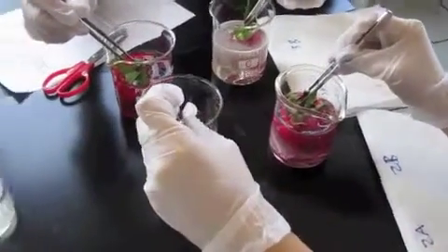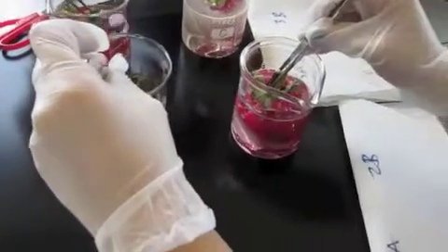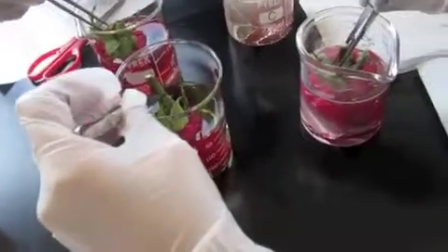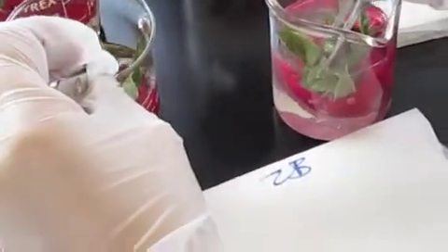Okay, so we're getting ready to take out the beakers 1B, 2B, and 2A to see the flowers. Well, do you just see that? Why? Oh, I think that's the rust. You can see how the flowers take them out. Take them out. Oh. Take them out. Watch out, make sure. It's countdown. Wait, yeah, okay, yeah. No, stop, take them out.